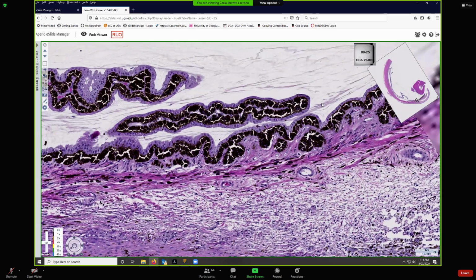And here are the zonular fibers. Here is our outer pigmented layer of the ciliary epithelium. Here's our inner non-pigmented layer. You can see the zonular fibers are coming in and attaching to this inner non-pigmented layer of the ciliary epithelium. So that went along with that accommodation question, and it had an image so that you could reference it to see if you understood where those zonular fibers are spanning between.